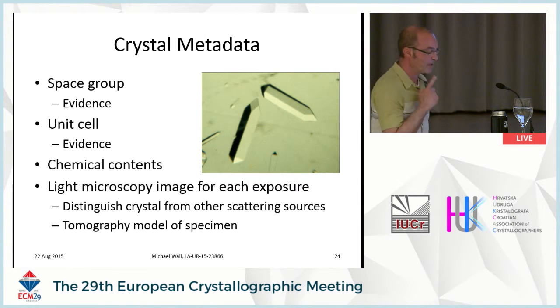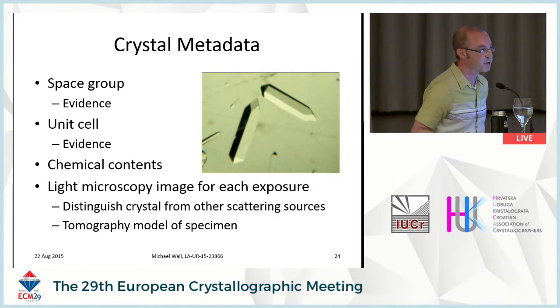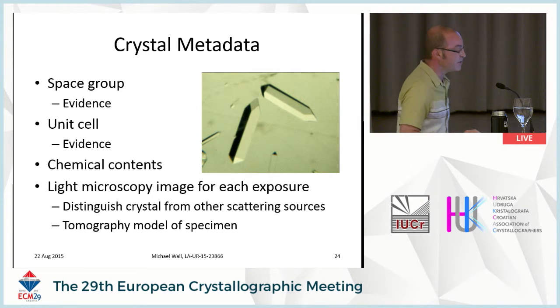Where maybe I have the most to add here is in looking at what's needed for the crystal. In looking at Bragg data, mostly we're in the position of being able to distinguish the Bragg reflections from the background just by their small size and peaked features, and at least to some approximation they can be subtracted from the background using some sort of image processing methods. With the diffuse features, we're not really in that position.